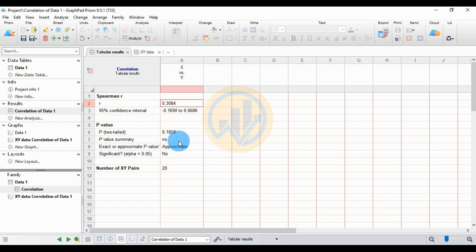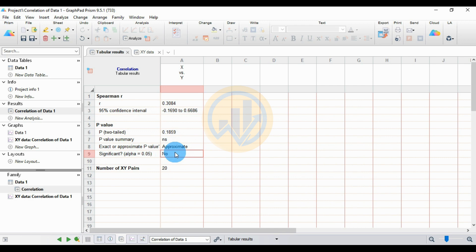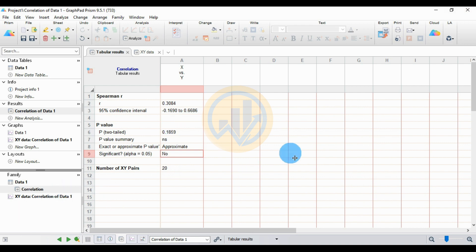The approximate p-value with significance level alpha of 0.05 is not significant, because we only have one variable pair selected. The number of Y value pairs is 20.